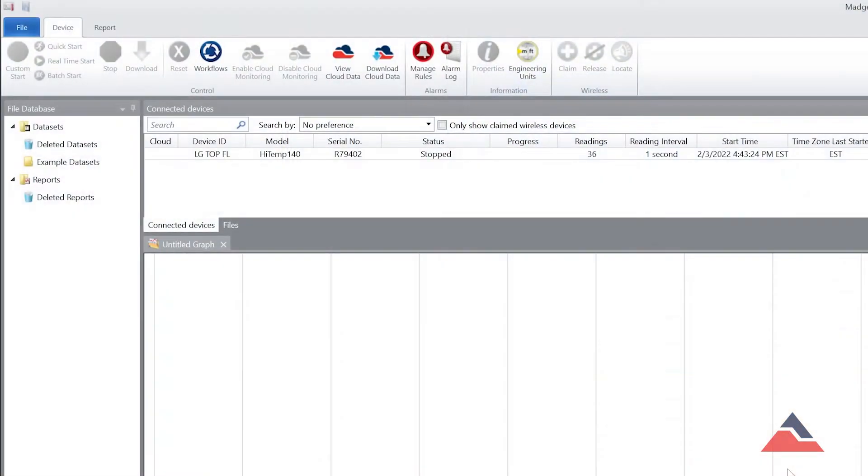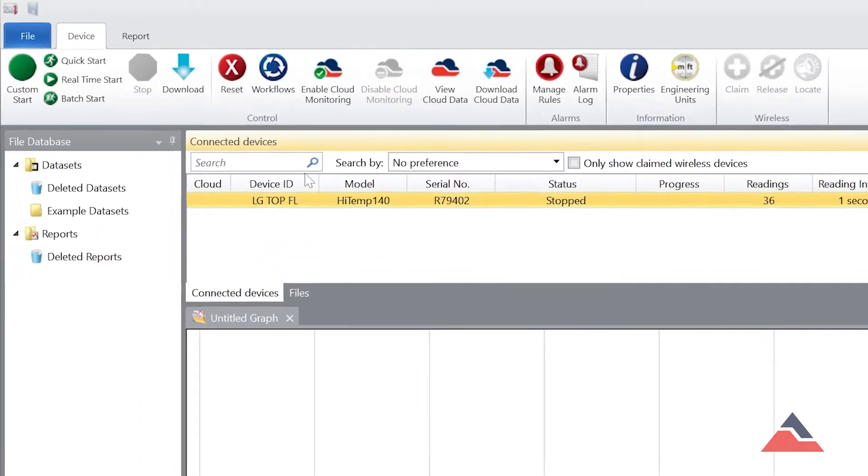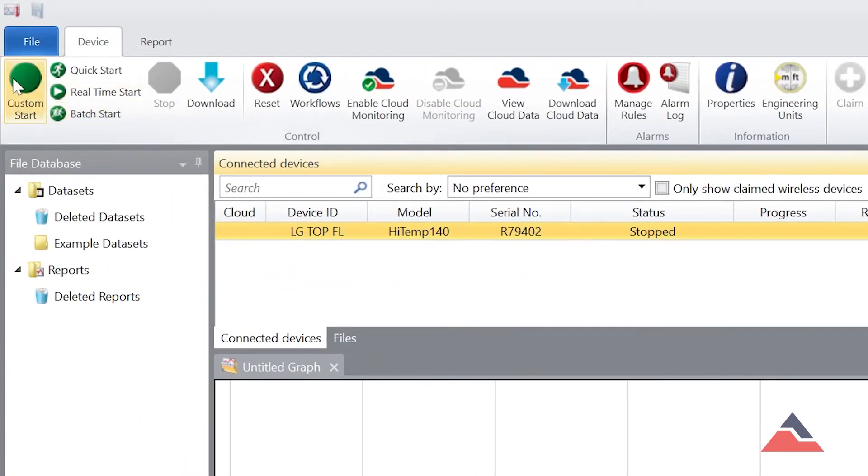In the software, the connected device will appear automatically under Connected Devices. When setting up for the first time, you'll select Custom Start in the menu bar.